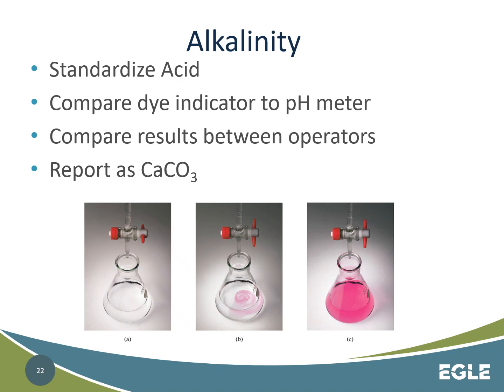But as you're titrating down, you need to compare that operators are getting the same number, because if not, someone might be overshooting the end result by adding the titrant too quickly. And then you're going to report your reading as calcium carbonate. All right. And as you can see, the titrants, typically you're going to have this on a mixing stand, and it's done in an Erlenmeyer flask. All right.